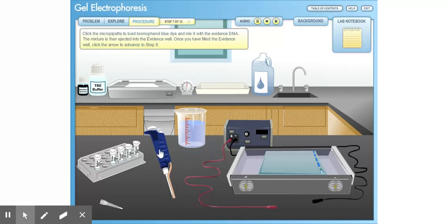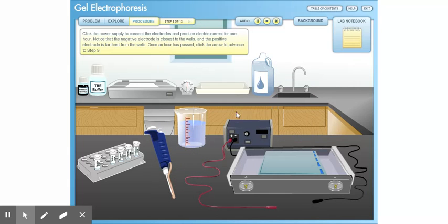Click the micro-pipet to load bromophenol blue dye and mix it with the evidence DNA. The mixture is then ejected into the evidence well. Once you have filled the evidence well, click the arrow to advance to Step 8. Click the power supply to connect the electrodes and produce electric current for one hour. Notice that the negative electrode is closest to the wells and the positive electrode is farthest from the wells. Once an hour has passed, click the arrow to advance to Step 9.